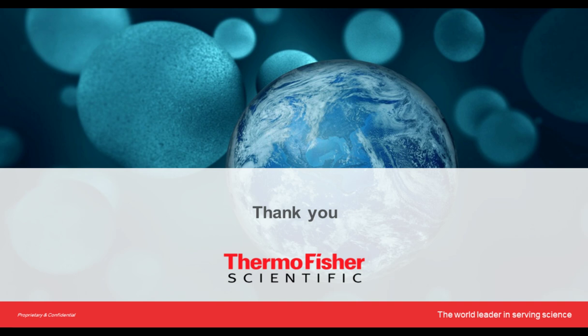I've talked through a range of different assays and a range of different applications here. And in some of them, it's going to require the goal of the experiment to be examined to decide how much throughput is necessary. So for example, with the TCR beta sequencing, for applications like minimal disease detection, the sensitivity that you're going for, 1 in 10,000 or 1 in 100,000, is going to have a huge effect on the number of reads that you're going to need for that. So yeah, I think that's maybe the short answer, and we can perhaps follow up offline with the full detailed information of what the multiplex level is on the different chip types for different kinds of applications.